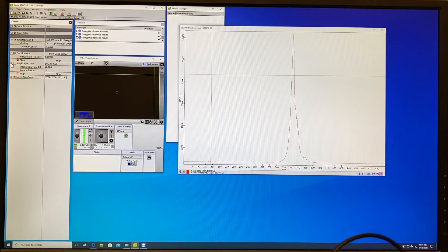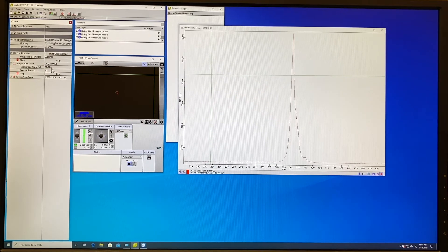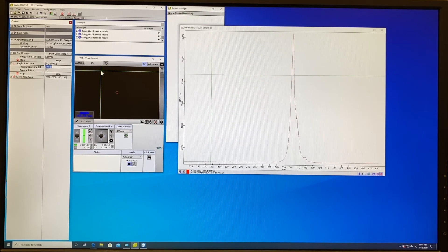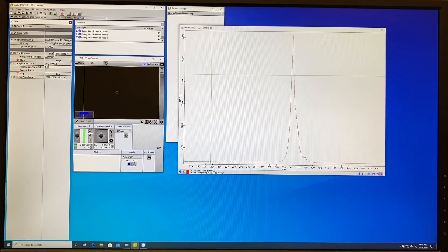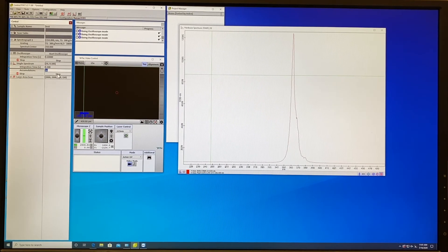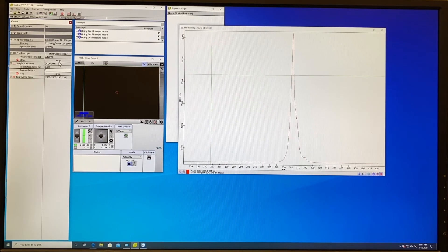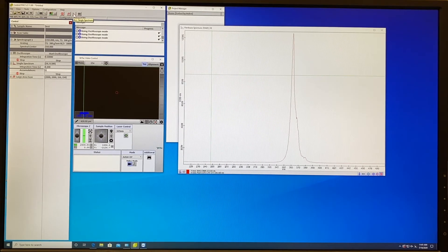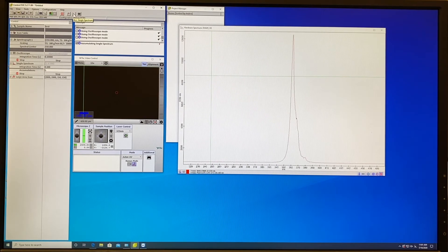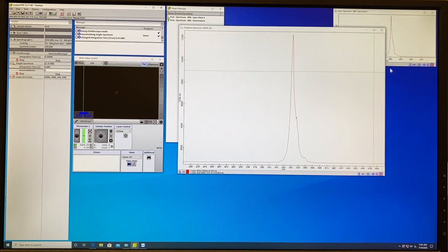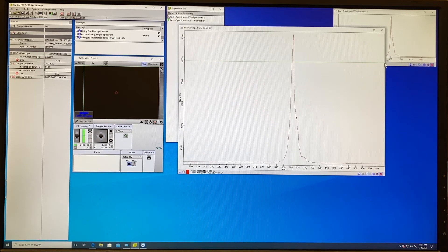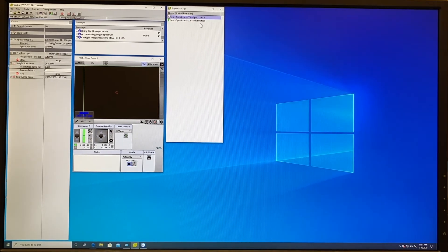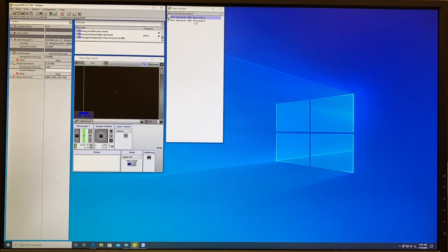Change the integration time to 0.1 similar as you had in the oscilloscope and set your number of accumulation to the file. After this you go on top and click Accumulate single spectrum.